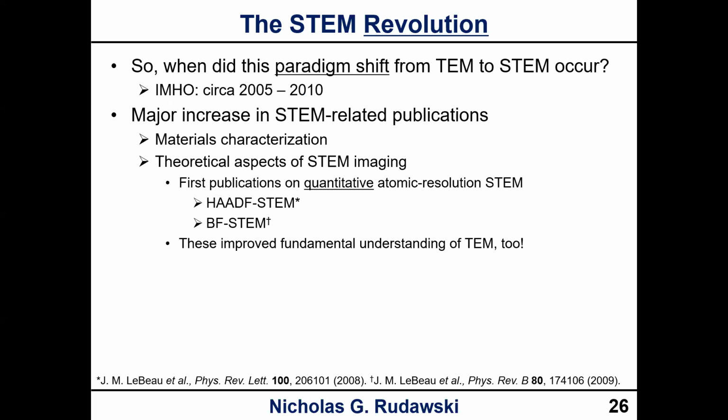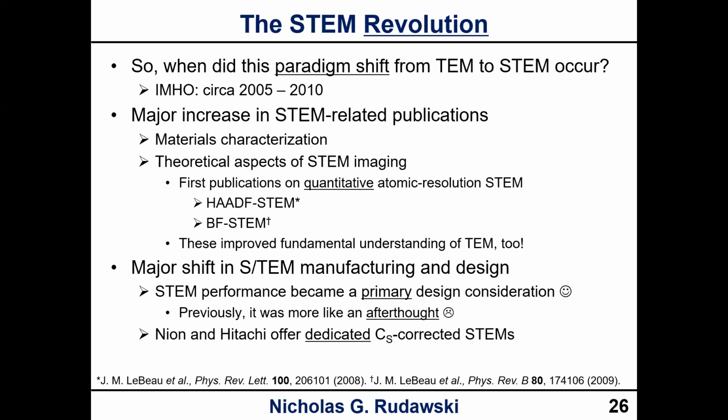We had the first publications on quantitative atomic resolution STEM come out, and these improved the fundamental understanding not just of STEM, but also of TEM, which is interesting. If you read these, you will learn that. There was also a major shift in STEM manufacturing and design. STEM performance became a primary design consideration, whereas it was more like an afterthought.